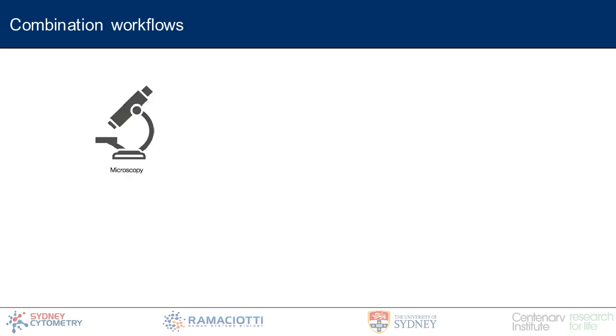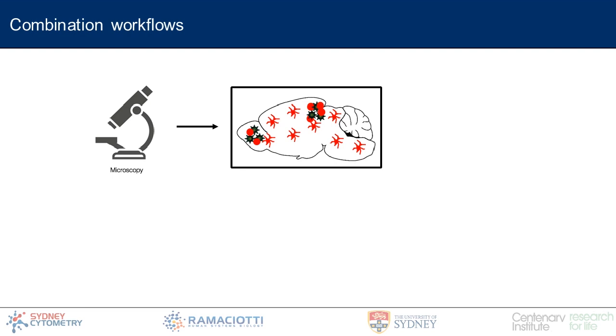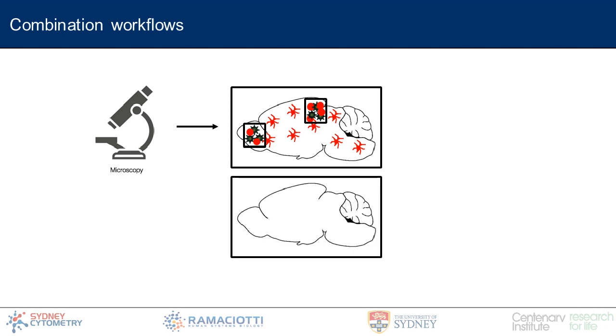If, for instance, we start by using microscopy, maybe some kind of fluorescence assay, we can look in a very low power way. We can look across the brain, find where our infectious foci are and where our areas of cellular infiltration are. And we can do this with very few markers, 2 or 3 markers at a time. Once we know where our areas of interest are, we can then target them more specifically and image these areas using many, many more markers, using larger panels, using imaging mass cytometry.